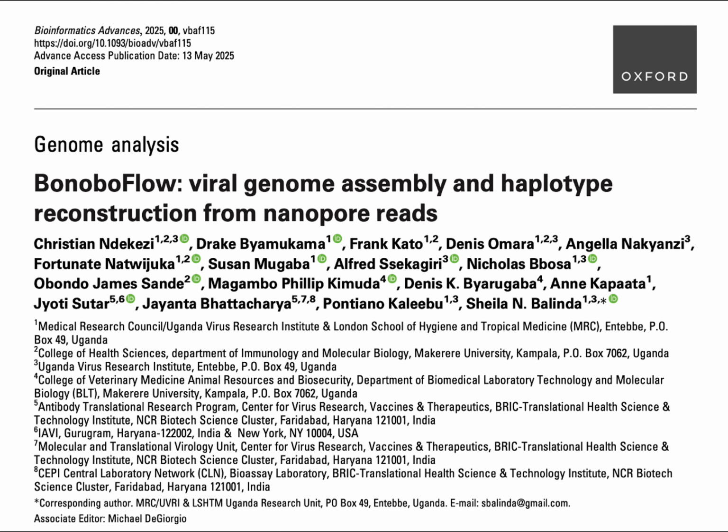Exactly. And the sheer genetic diversity of viruses globally means if we don't have precise, accurate ways to analyze their genomes, we're basically flying blind. Flying blind, yeah. Accurate reconstruction isn't just about saying, okay, this is virus X. It's about getting a true biological picture of individual genomes and, importantly, all the different forms, the quasi-species or variants that might be lurking within even a single infection. Right, all those little variations matter. They fundamentally matter for understanding impact.